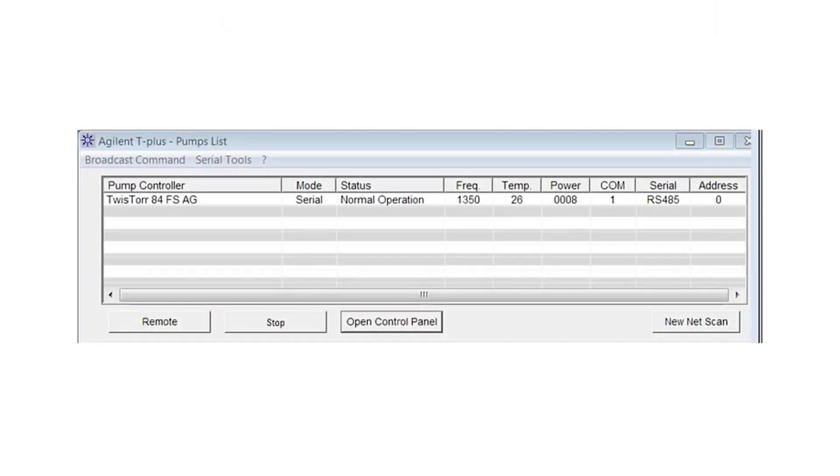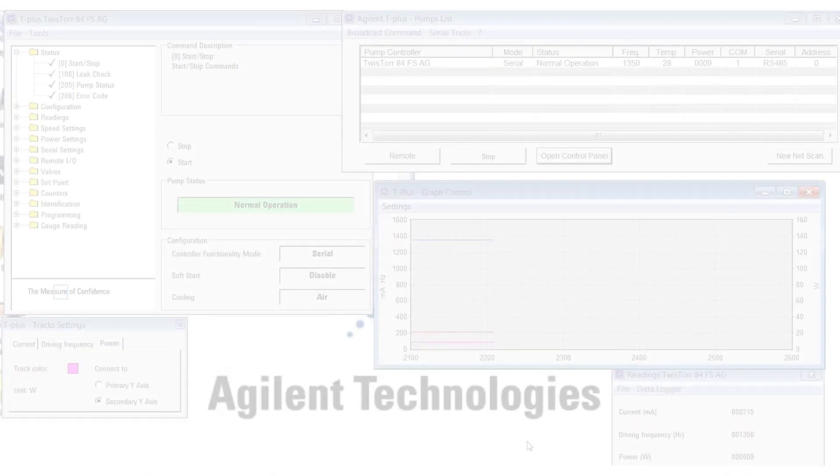Rotational speed, power draw, etc. I'm going to open a sub window control panel and then we will add a couple of parameters to the graphing section so we can track them over time as we add a gas load to the system.